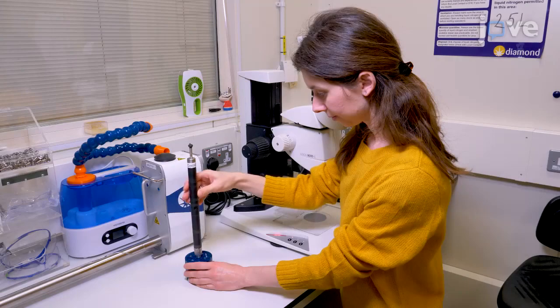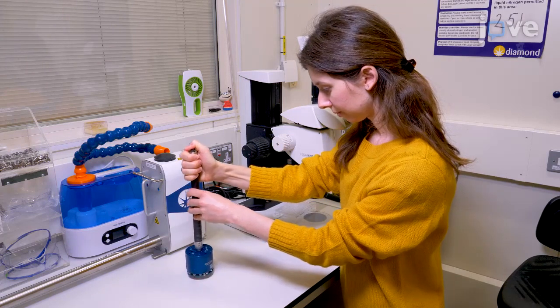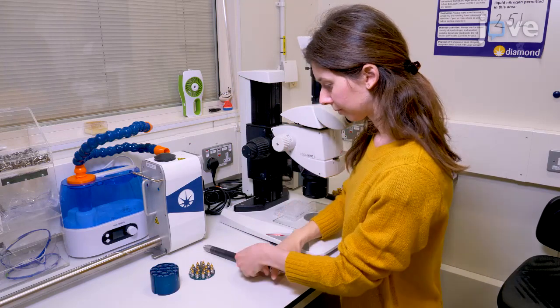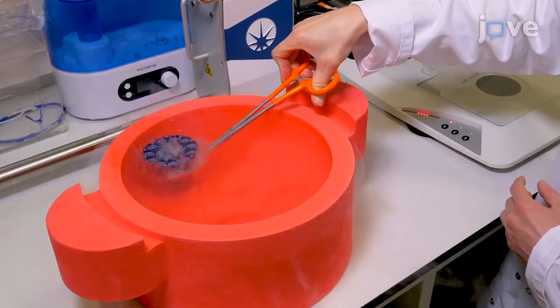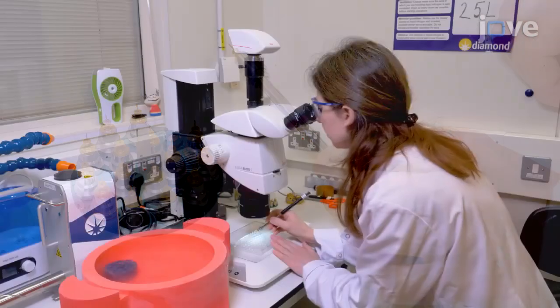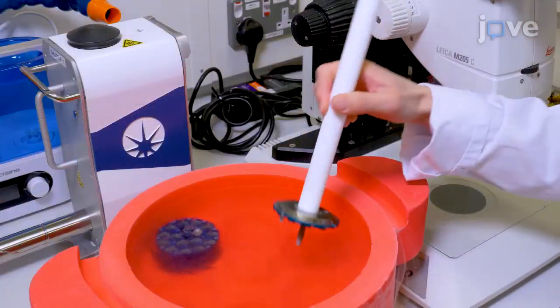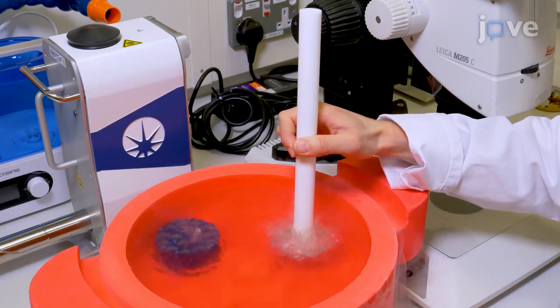Begin by separating the lid from the base of the combi puck such that the sample holders remain attached to the base and vials are retained in the lid. Immerse the lid with vials in liquid nitrogen. Then attach a sample holder and adapter to a magnetic wand and harvest the crystals. Flush cool each sample directly into the combi puck, noting the sample position.